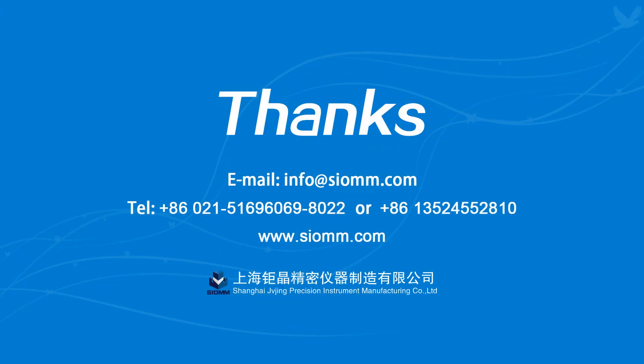When operating, if you have any questions or problems, please contact us by email at info@cmo.com.